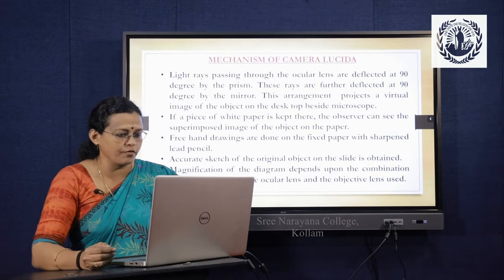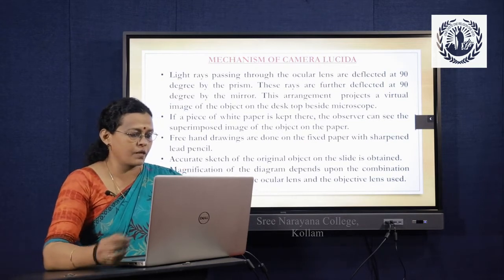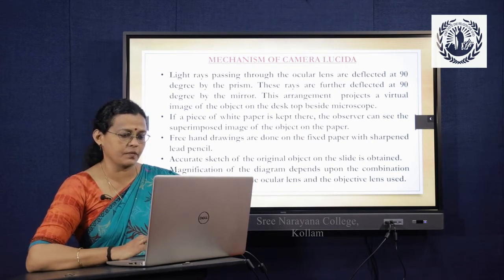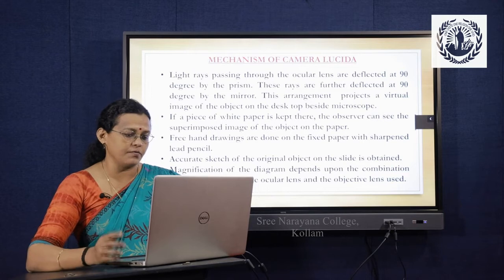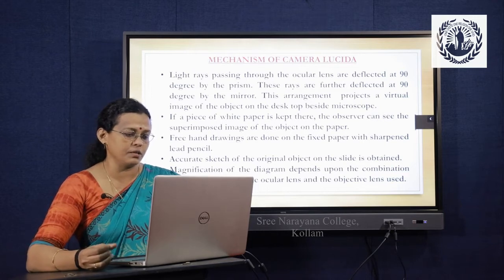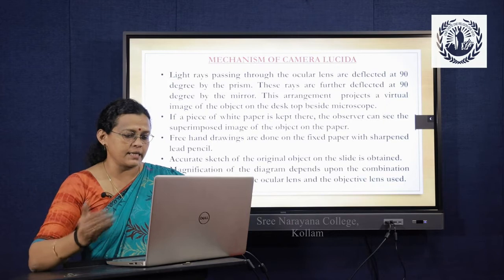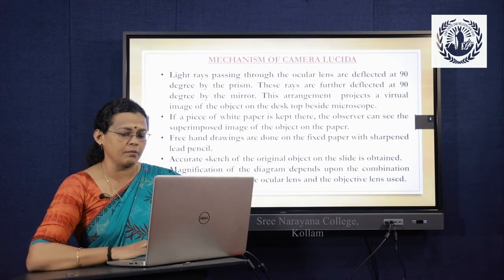Now, the mechanism of its working. Light rays passing through the ocular lens are deflected at 90 degrees by the prism. These rays are further deflected at 90 degrees by the mirror. This arrangement projects a virtual image of the object on the desktop beside the microscope. In the next slide I will be showing you the diagrammatic sketch of this explanation, from which we will understand more.